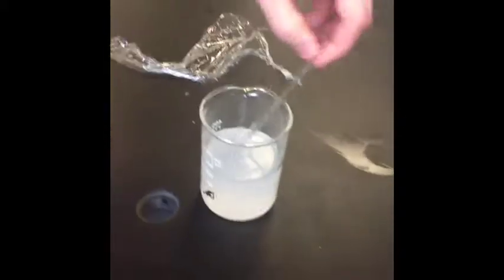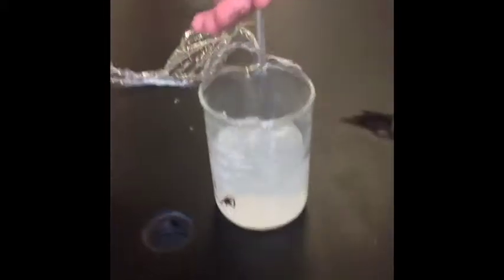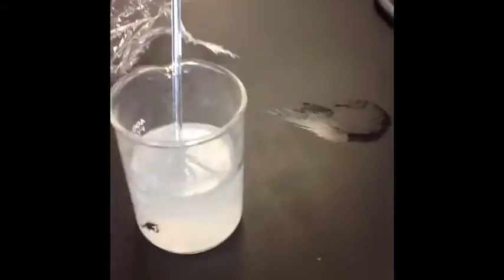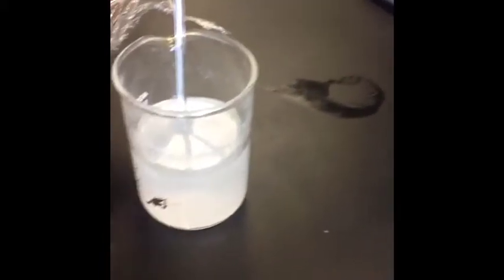Well, it turns out that we didn't add enough acid yesterday, or nobody did. So as a result, today we added more acid, and this is pretty much all we did today. And now we just play the waiting game, and see what happens tomorrow. Just wait till it all dissolves, and then tomorrow, hopefully it'll be clear, and we'll boil it off.